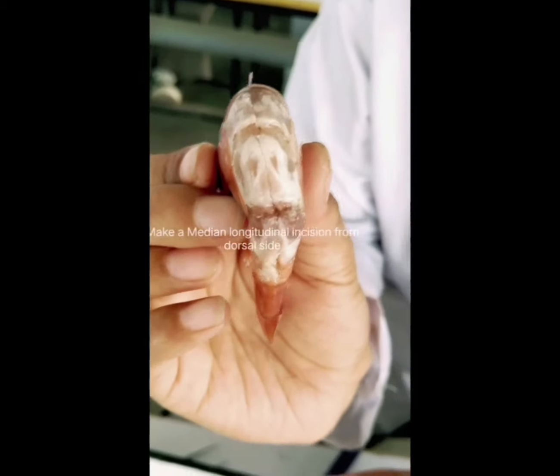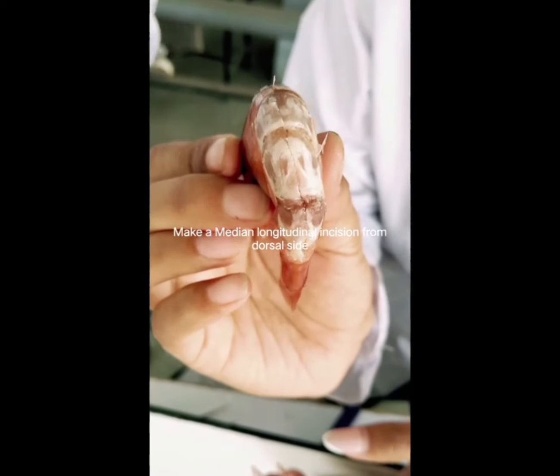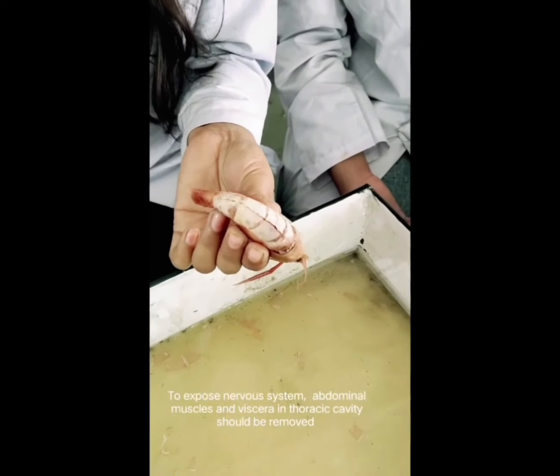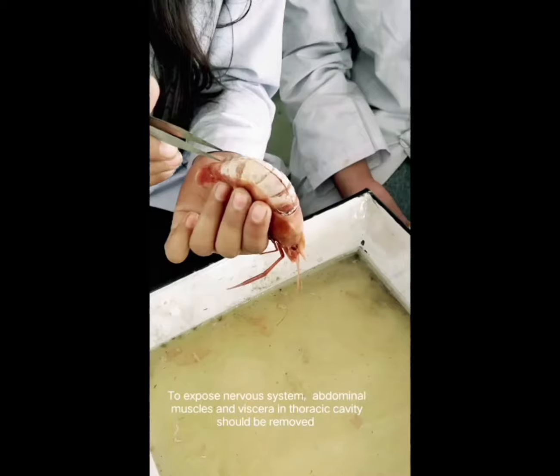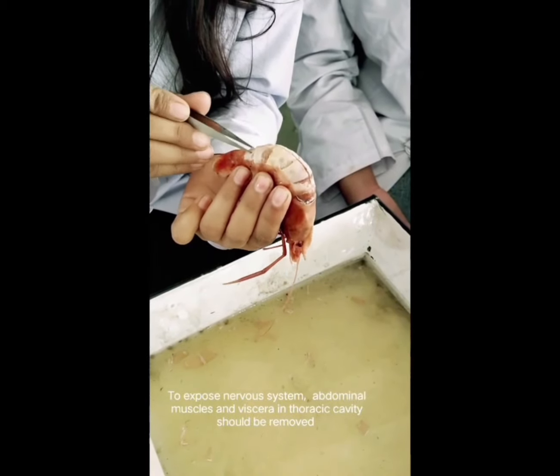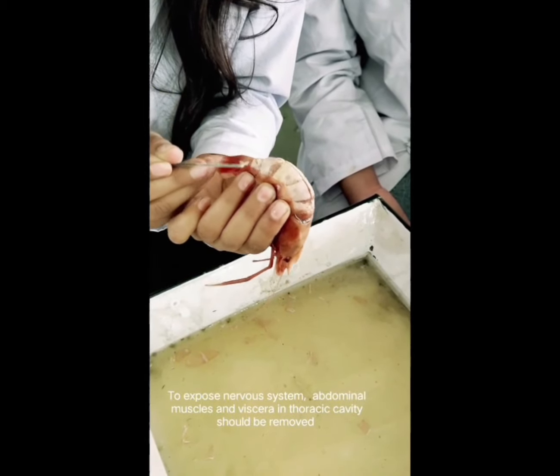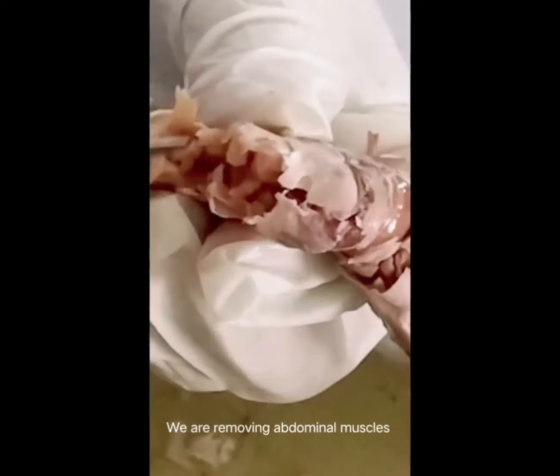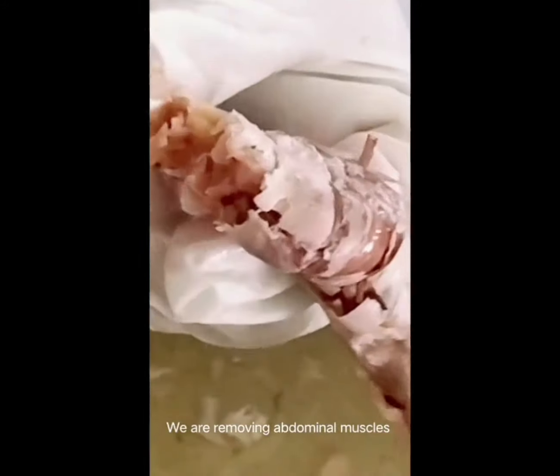We expose the prawn to get the nervous system exposed. This is the prawn from the dorsal side. This is the median longitudinal incision. We use the abdominal part of the prawn to remove it. This is the abdominal part of the prawn. We slowly remove the abdominal muscles so as not to damage the organs.